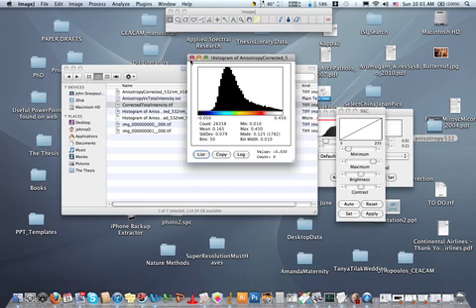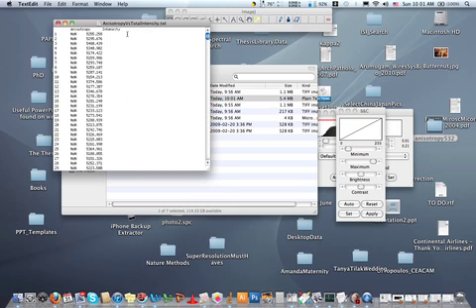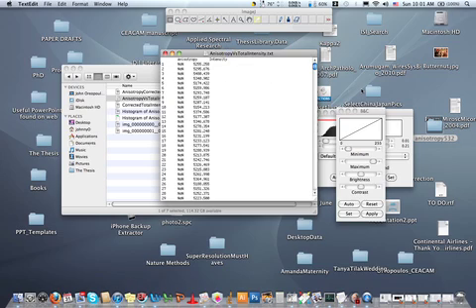It did it. So now when we go into that same file folder, you see a text file, anisotropy versus total intensity .text. There it is, and you can open it up, and you'll see that there are a lot of pixels that are NaN, not a number. Those were the ones that we thresholded to 0 in the total intensity image. And there's all the data there.